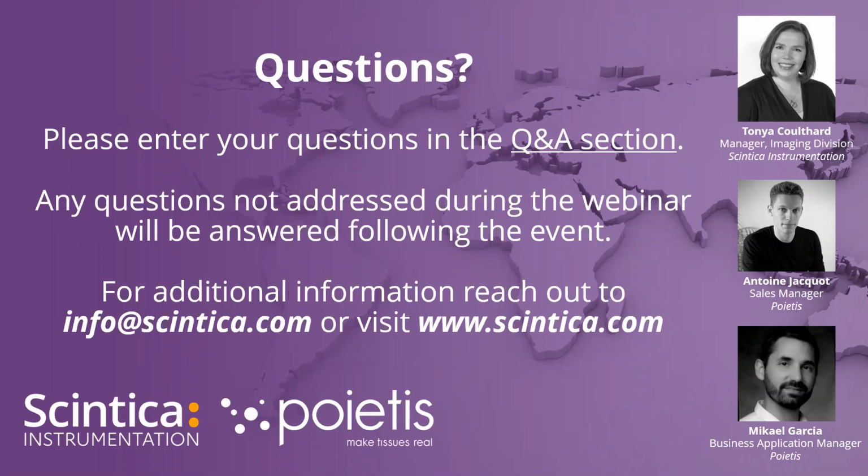Perfect, thank you. Another question: are there any limits to the types of cells which can be used with the NGB-R, and where would someone typically source those cells? I'll take a stab at this, and the guys can add to it. Based on previous webinars and conversations I've had with the team, there really are no limits to the types of cells that would be used. The team has used keratinocytes, fibroblasts, all types of cells, including different types of stem cells: pluripotent stem cells, embryonic stem cells, human cell lines, human cells taken out of a patient, or even cell lines, which are typically used as well.